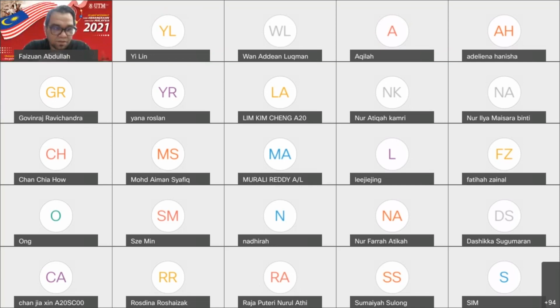How much is the volume of the 1000 ppm that I need to transfer into the 100 milliliter volumetric flask? What is the volume? 10 mil, right?